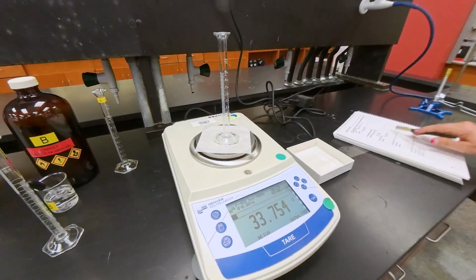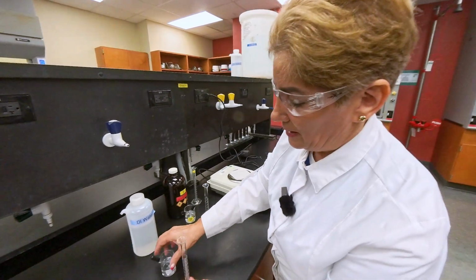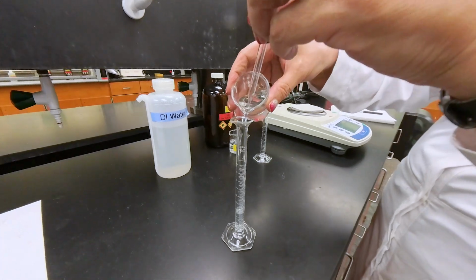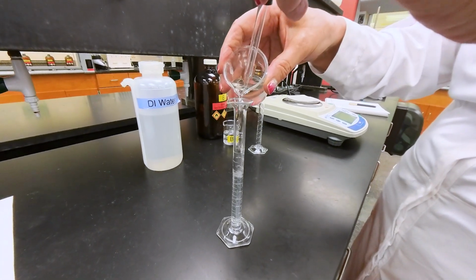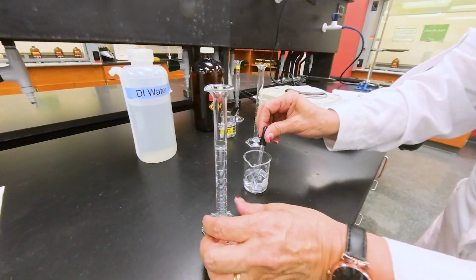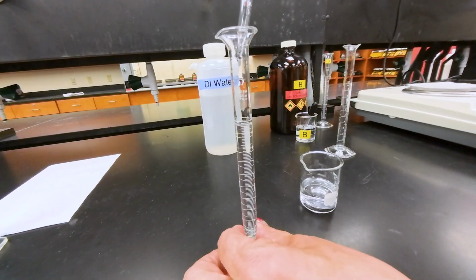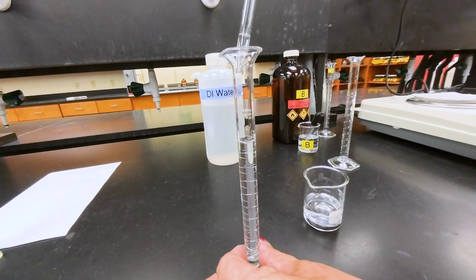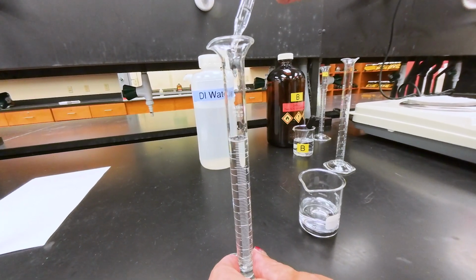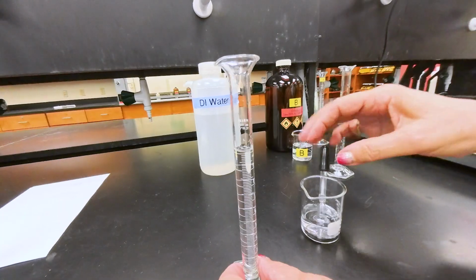Then we are going to transfer exactly 10 milliliters of water, because we want to have the mass and the volume. So pour as close as 10 milliliters, use a dropper to adjust the last drop until the meniscus is at 10, which is the lowest point of the curve. You already know what the meniscus is at this point, but I like to repeat it for fun, I guess.